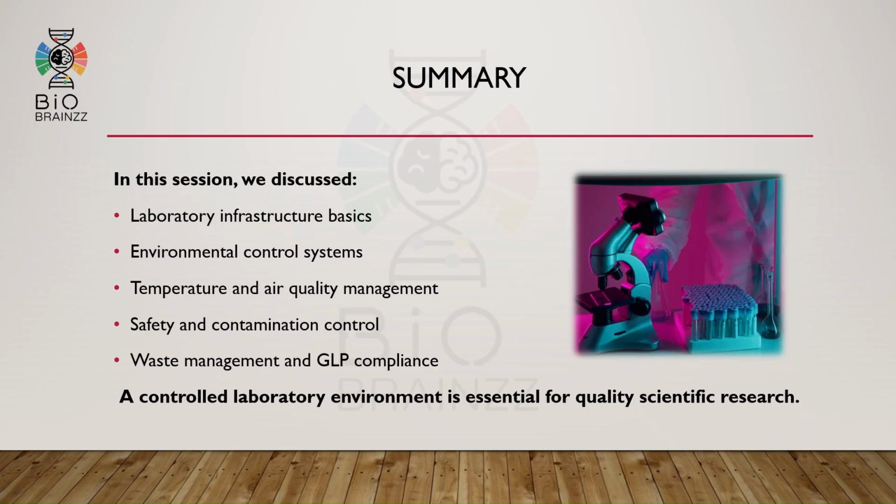So, let us summarize today's session. Today, we discussed laboratory infrastructure, environmental control systems, temperature and air quality management, contamination control, safety systems, waste management, and GLP compliance. Overall, a controlled laboratory environment is essential for quality scientific research.